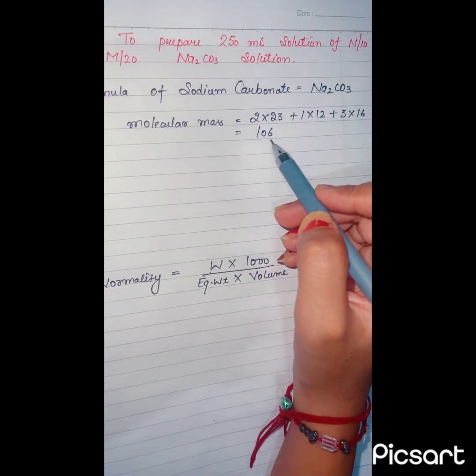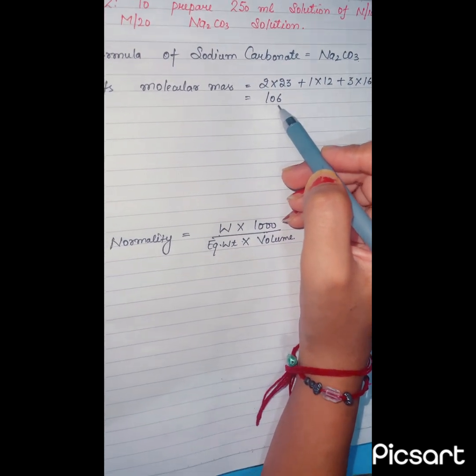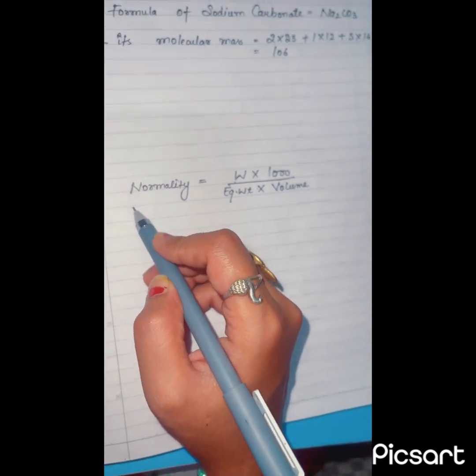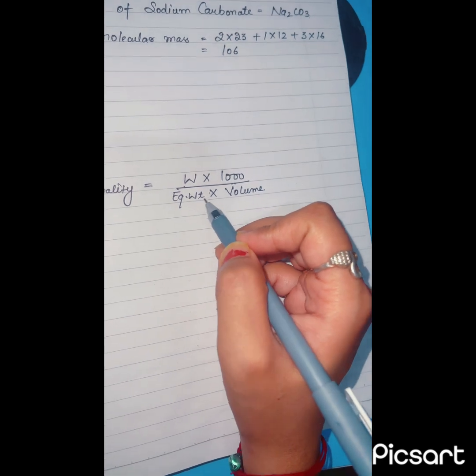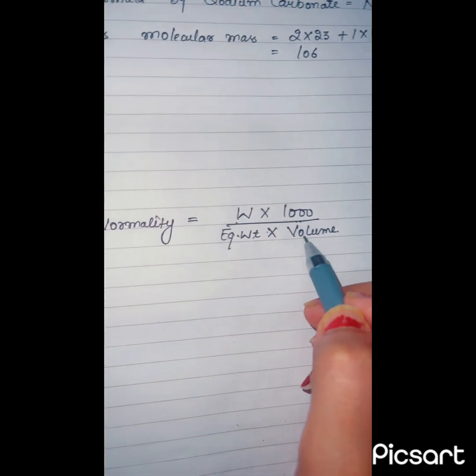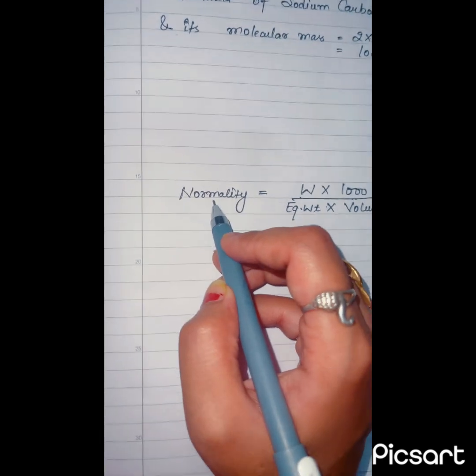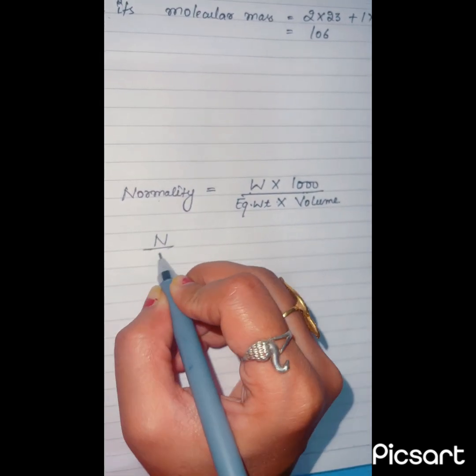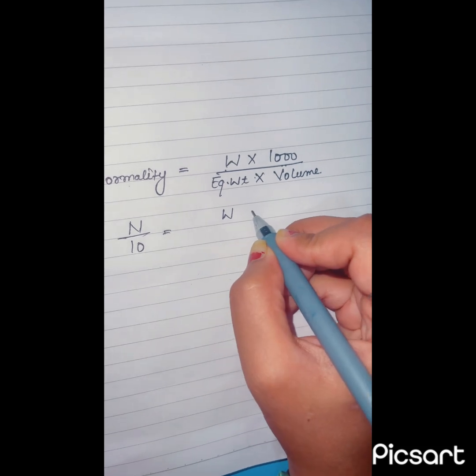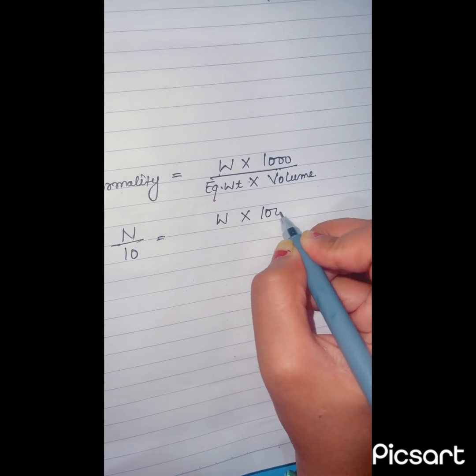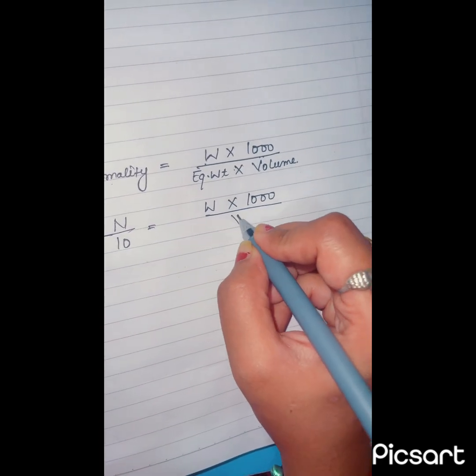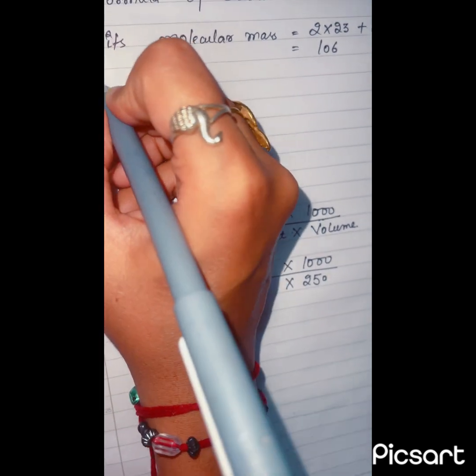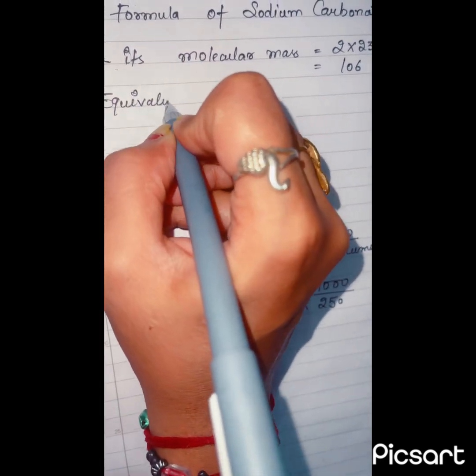Then we come to the topic of the formula of normality, that is weight into 1000 divided by equivalent weight into volume. Normality is N by 10, weight we have to find, that is 1000, equivalent weight we don't know, we have to find, volume is 250.